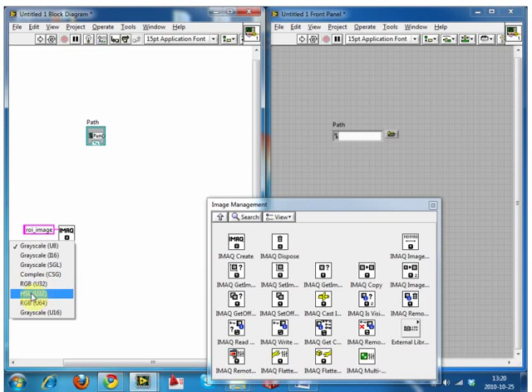There are some occasions that you'll use HSL, which stands for hue, saturation, and luminosity, and I will touch on it if I show you a color change example. The problem with RGB images is that they don't contain separate information on intensity. All the false color images that you get from the confocal are hard to work with because they're RGB values. As you go from light to dark, it changes colors other than just the red, just because of how it represents.